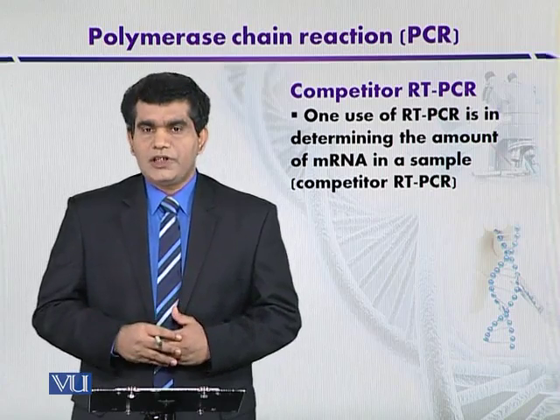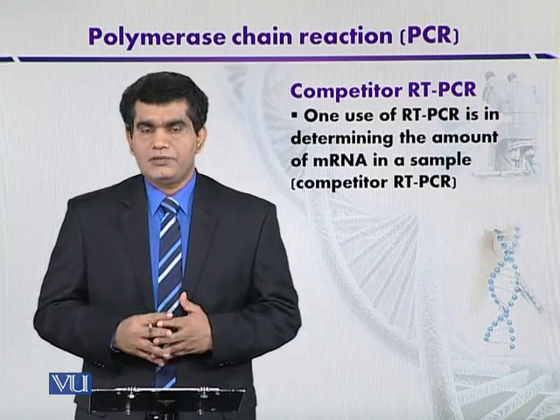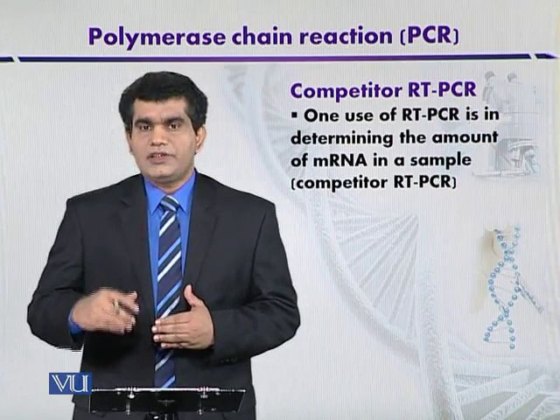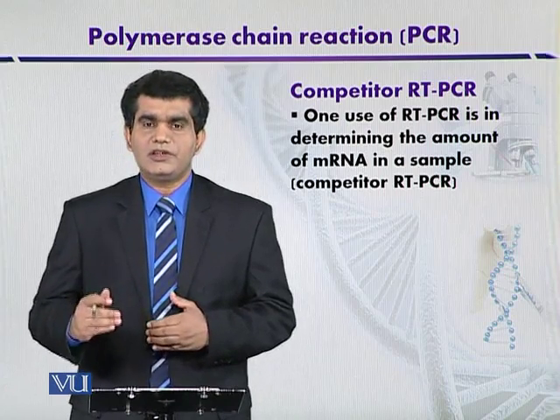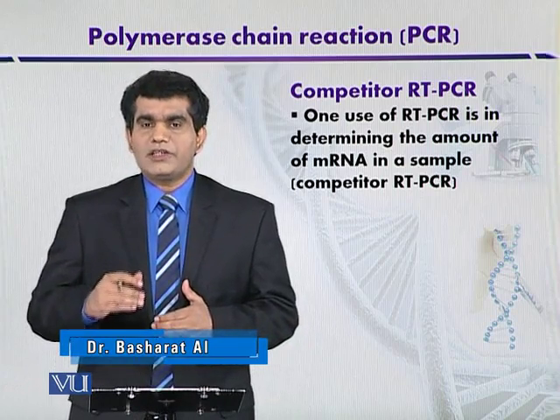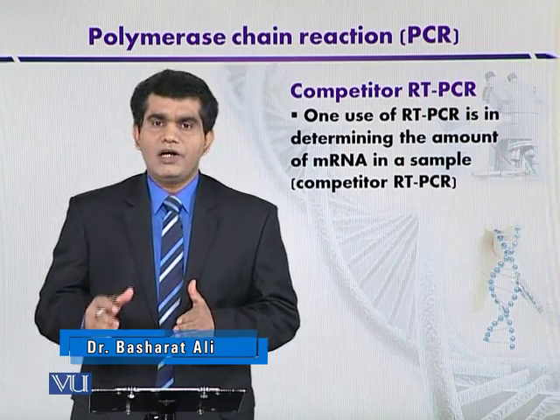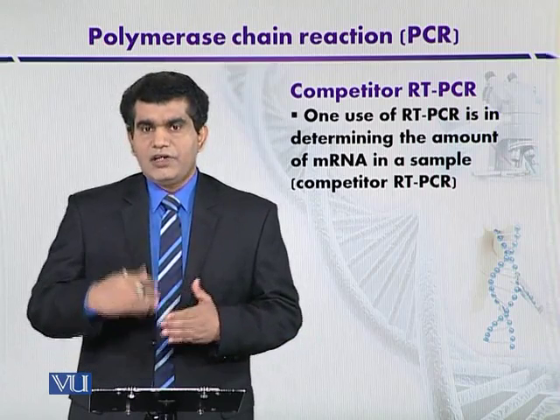पहले हमें ये पता होना चाहिए कि what is this competitor RNA? Competitor RNA, it is actually the synthetic RNA molecule that can be synthesized under laboratory conditions, and it can be used as a control in different PCR reactions that are based on RT-PCR. Now, what are its applications?